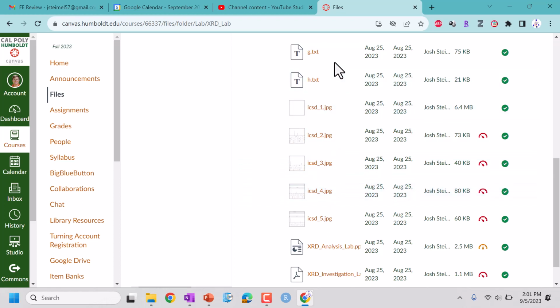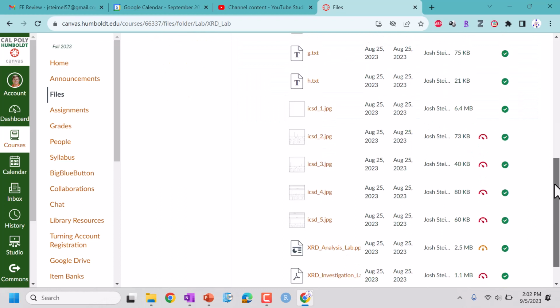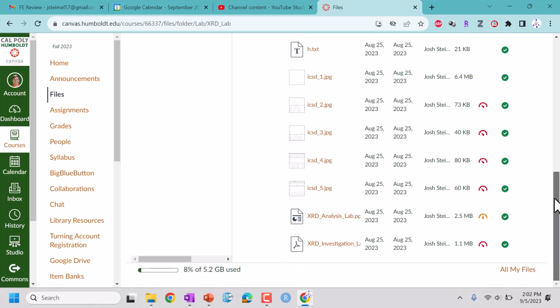Now, obviously, 2 of these text files are going to end up being polymers, PMMA or PEO or PEG, and that's going to be based on the width of those peaks. PMMA is obviously the much more amorphous material, so it should have wider peaks, whereas PEG or PEO should have much narrower peaks, but still wider than metals, to indicate that long-range order indicative of semicrystalline materials.